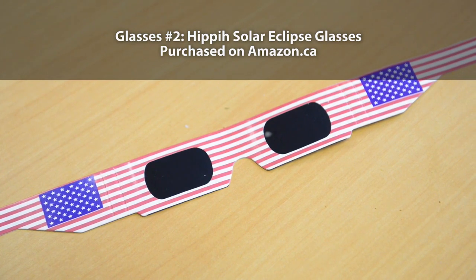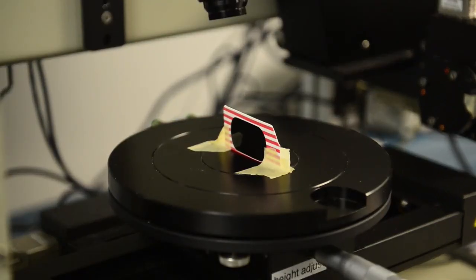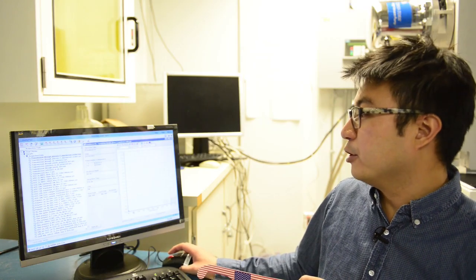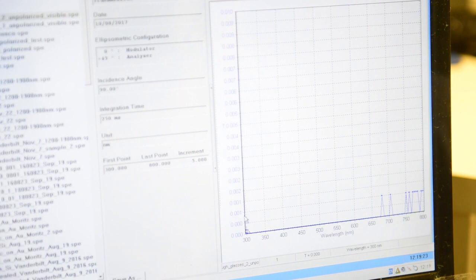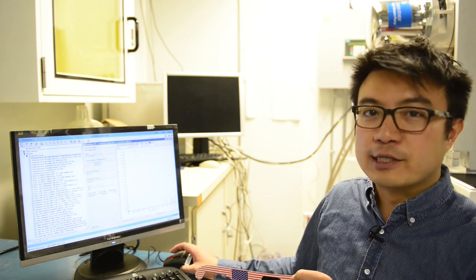Now we're going to run the same test on a different set of eclipse glasses. You can see it's pretty close to zero — the transmission is almost zero across the entire UV and visible range. But if you go up to the higher wavelengths, which is the red in color, then perhaps you see a little bit more transmission compared to the first set of glasses we tested.